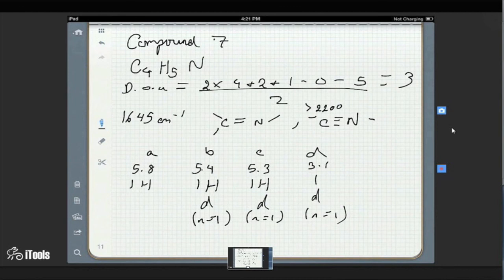We can't decide if the nitrogen should be a nitrile or an imine. Well, if it's an alkene and a nitrile, that cleans up our degrees of unsaturation. That's 2 degrees of unsaturation, and 1 degree of unsaturation. It could also be an alkyne and an imine, as well.